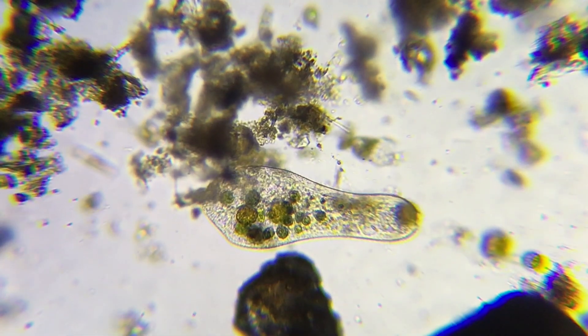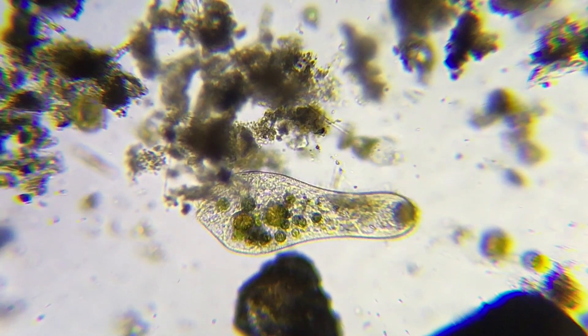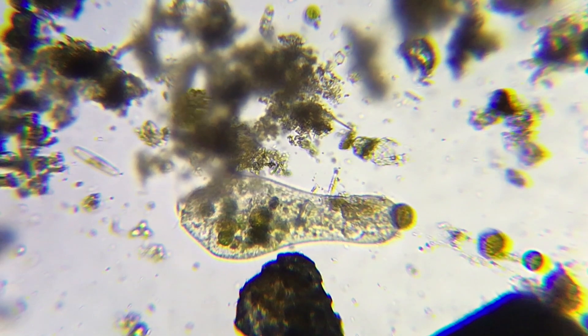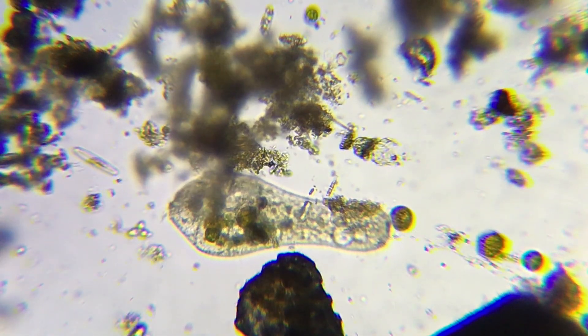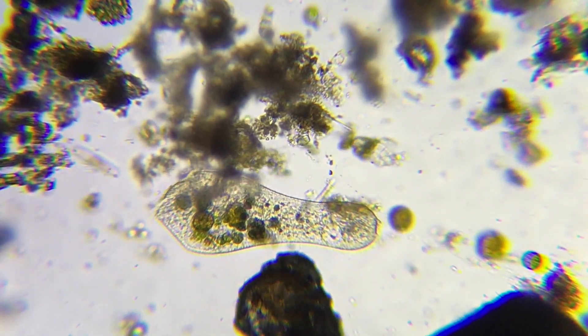Here we have the same stentor, except there's a nira right in the side — that's a colony. We see another one of those later in the video, I'll tell you when we see it. It's sort of just trying to stick itself somewhere, because it's a colony.